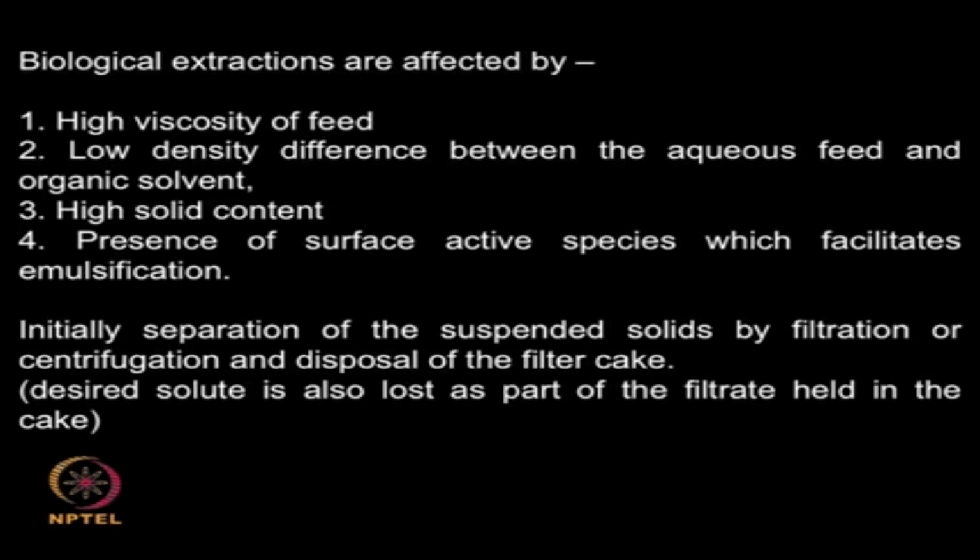Now if you look at biological systems, they create many problems during extraction unlike a normal chemical system, because the feed will have a very high viscosity because of presence of cells, biomass, intracellular material, DNA, cell debris and so on. So, the viscosity is going to be very high.